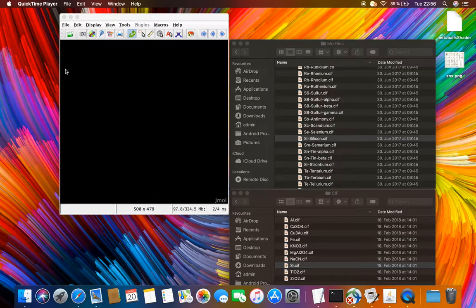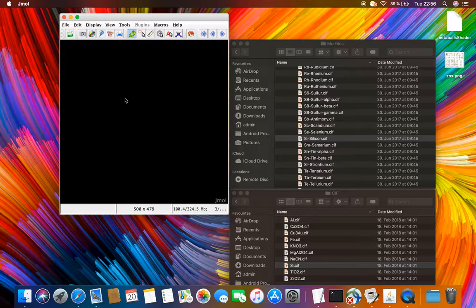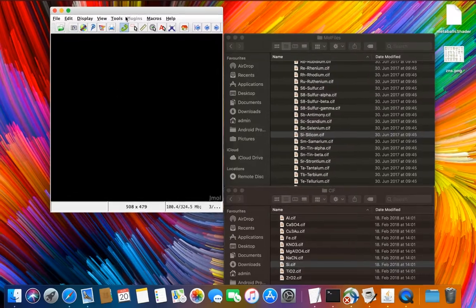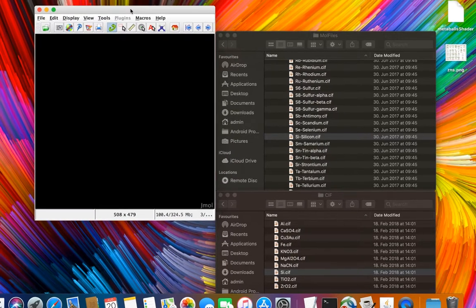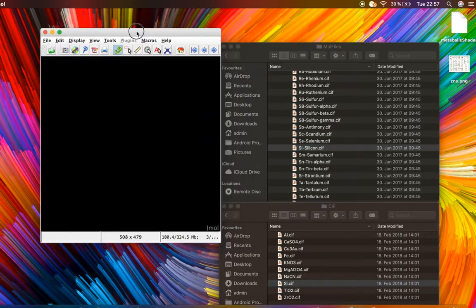In this tutorial I'll be showing you guys how to visualize crystal structures from a .cif file — that is a crystallographic information file — using Jmol. In order to do so you need to launch Jmol by clicking on the jmol.jar file, as I showed you in the last tutorial where I showed you how to install Jmol and get it running. Launch Jmol and you will see a window such as this one.